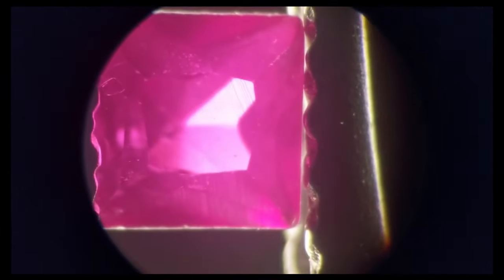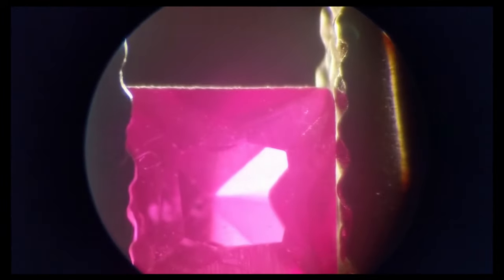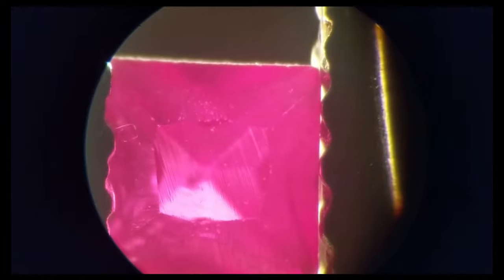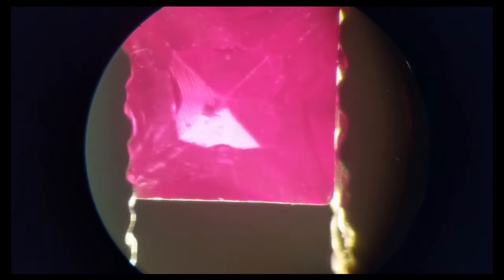If you see these lines inside of ruby you could be almost 100% guaranteed that the stone you have is a synthetic. This is like the number one indicator which we do check as gemologist to see if the stone is synthetic or natural. I'm just zooming it out again so you could see these lines and you can see it's going throughout the whole stone.